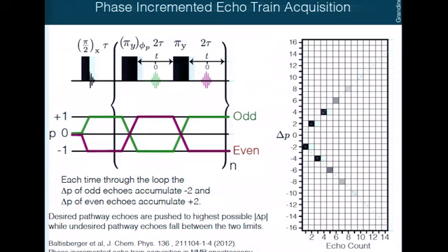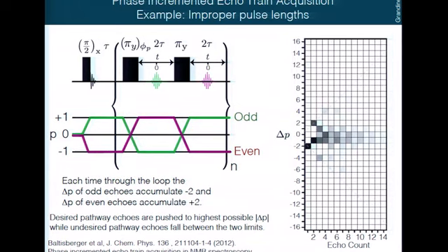So if I made just bad pi pulses in this, maybe they're 120 degrees, then you'd see all the bad guys showing up here because you've lost your signal. The really cool thing about this, of not phase cycling, is that you get to see where your signal went when your experiment's not working. So if you say, why am I not getting the echoes or signals that I'm supposed to be getting? Well, if you have phase dimensions, you see that's where it went.